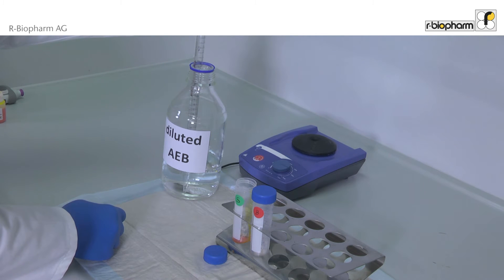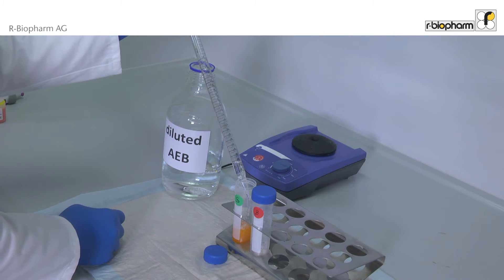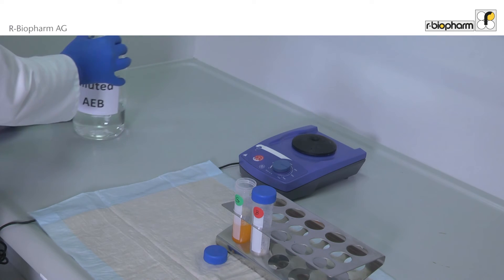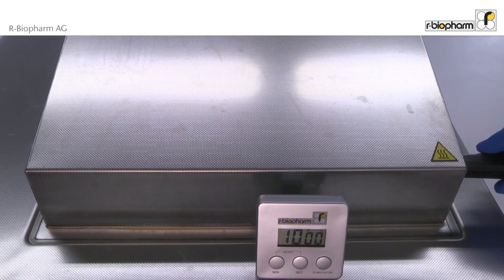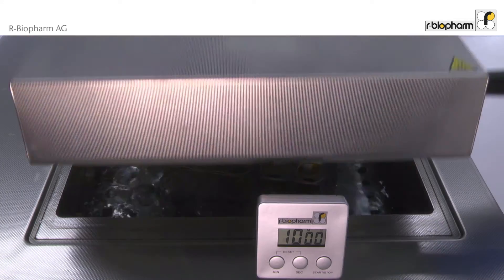To avoid cross-contamination, use a new pipette tip for every sample. Mix thoroughly for at least 30 seconds to dissolve the whole sample. Incubate the sample for 10 minutes in a boiling water bath.